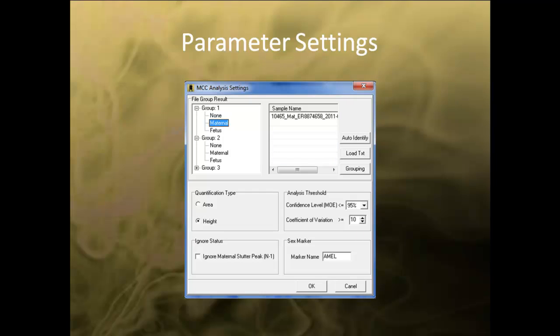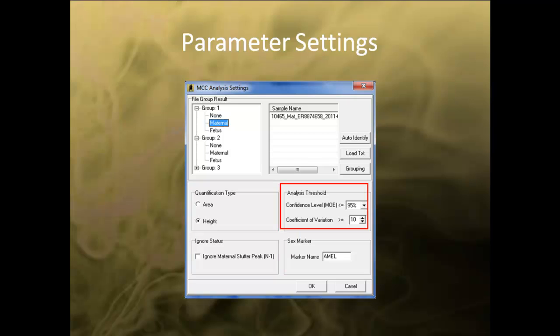In the Settings dialog box, you can select to quantify by area or height, specify the sex marker, and choose to ignore any maternal allele detected in the fetus sample if it is in the stutter position. The confidence interval chosen in the analysis threshold is used in the calculation of the margin of error for the data set as well as the degree of freedom. The coefficient of variation threshold will flag any sample that is over the set threshold. Once you are finished, click OK to begin MCC analysis.